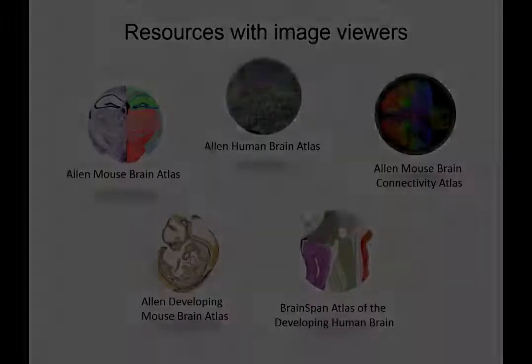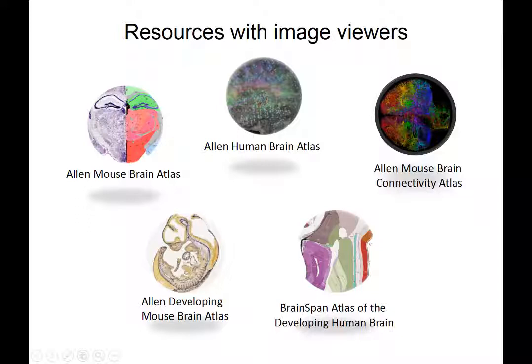Using the Allen Brain Atlas Image Viewers. Each of these resources contain viewers to inspect image data.